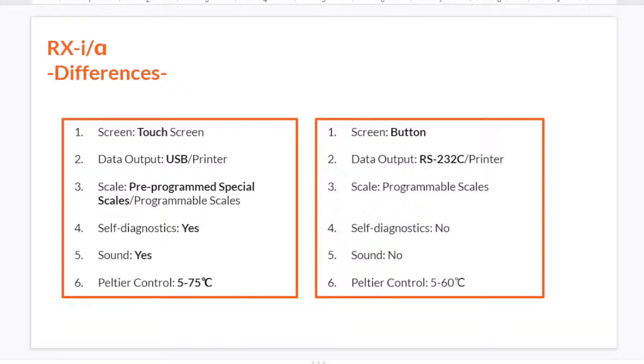They also have different data output systems. RxI has USB and also a printer port. Rxα has RS-232C and also a printer port.